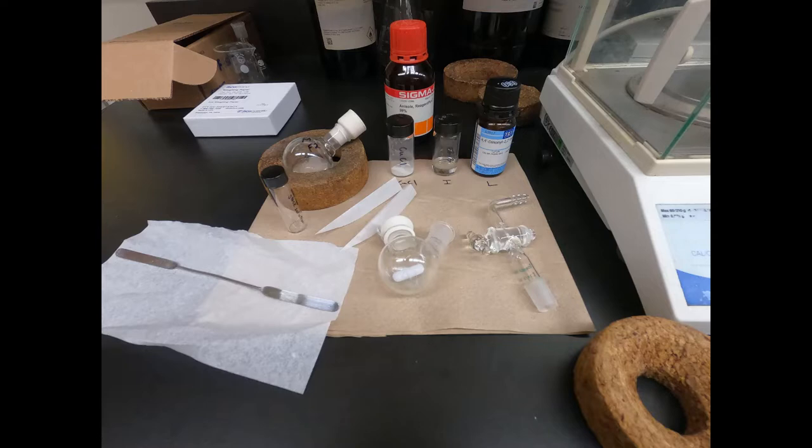The materials I use in this video to conduct a polymerization include a freshly distilled monomer, an initiator, copper(I) chloride, a ligand, and anisole, which I'll use as the reaction solvent. I'll run the reaction in a 2-neck round bottom flask equipped with a stir bar and gas flow adapter.